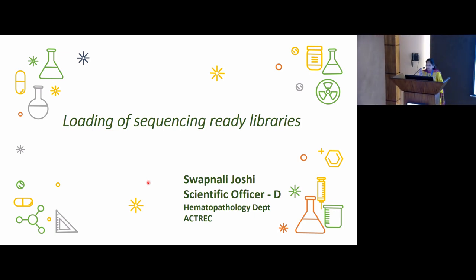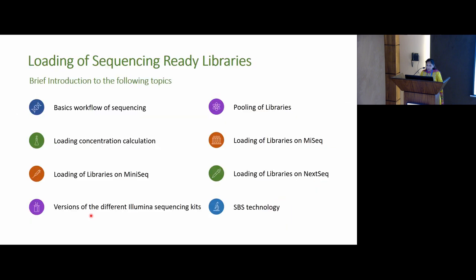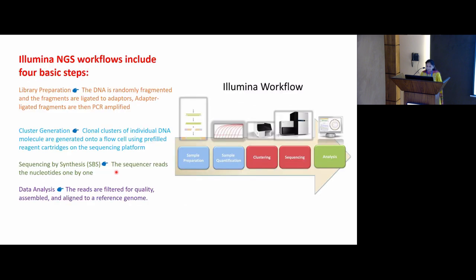Okay, so good morning everyone. Today I'll be talking about loading of sequencing-ready libraries. These are the topics that will be covered in my presentation. First of all, the basic workflow of sequencing, pooling of the libraries, how to estimate the loading concentration of the library, how the libraries are loaded onto MiSeq, MiniSeq and NextSeq, what the different versions of Illumina kits available in the market are, and how SBS technology works.